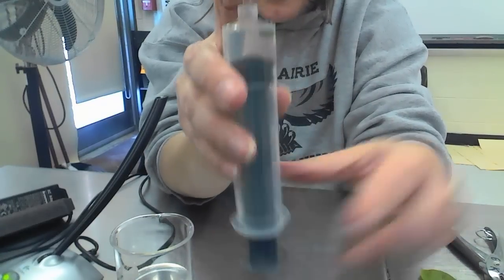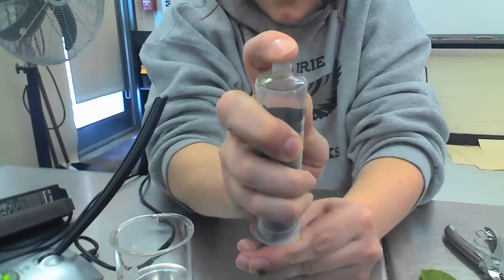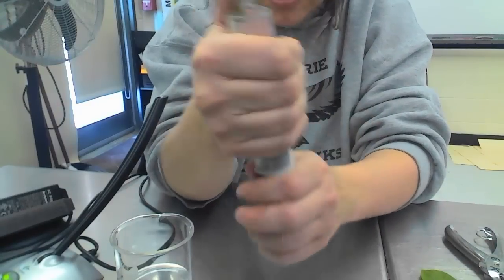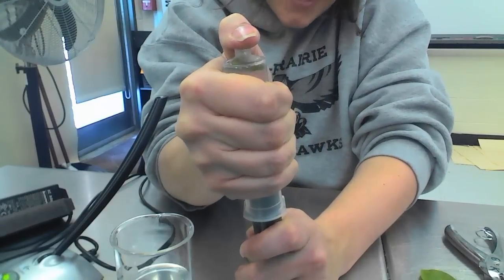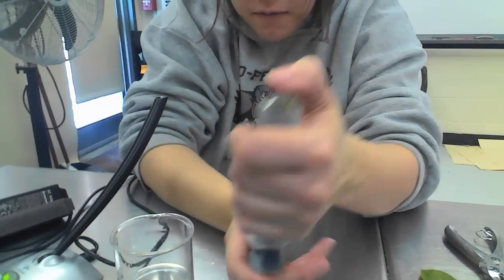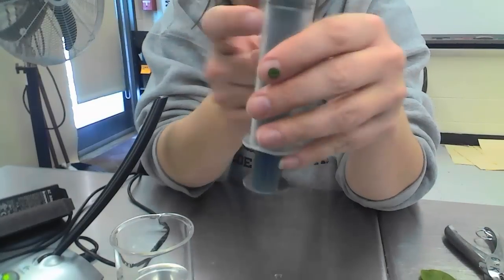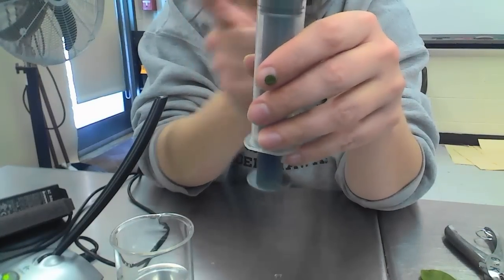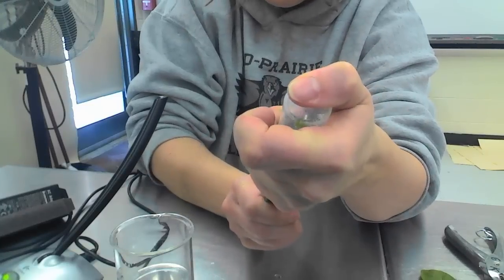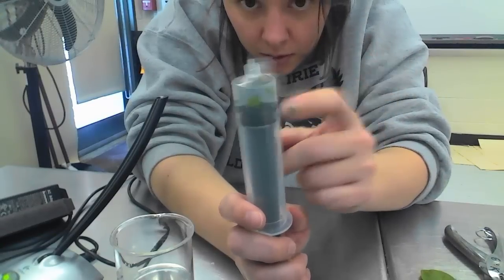Then I'm going to put my finger over the area where there normally was a needle, and I'm going to pull. What I'm doing is creating a vacuum to cause all those air bubbles to come out of the leaf. As you see, water. If I do it well enough, you can start to see that some of the chads are falling down to the bottom because I sucked out all the air bubbles from them. You can see they're falling. You need to continue that until all of them come down to the bottom.